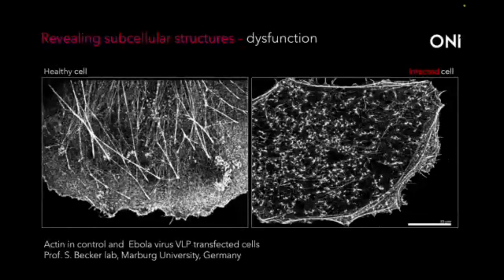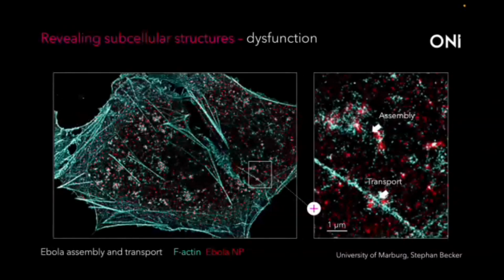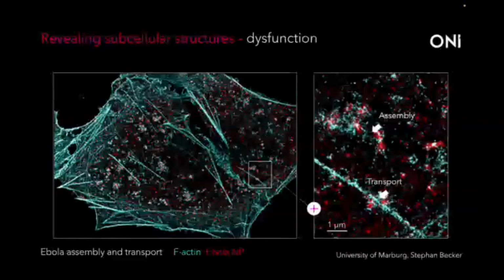However, actin is actually quite a clear tool. There are many, many processes where dysfunction would in no way be visible through conventional microscopy and would only be visible through super resolution methods. The other thing we can see here is that we can correlate the processes that lead to this dysfunction. Even though we may be able to see some of the outcomes of dysfunction using conventional microscopy, it would be very hard to see the mechanistic causes of why you have this dysfunction.